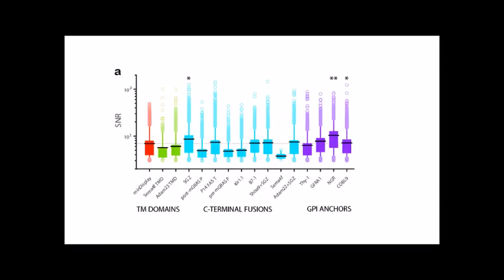So we made a small library, what we're calling a bookshelf, of different membrane display sequences. And then we used that optical mini signal that I told you about a moment ago as the screening criteria. We looked at the signal to noise ratio of those optical minis and found variants that have larger signal to noise ratios than that previous display sequence.